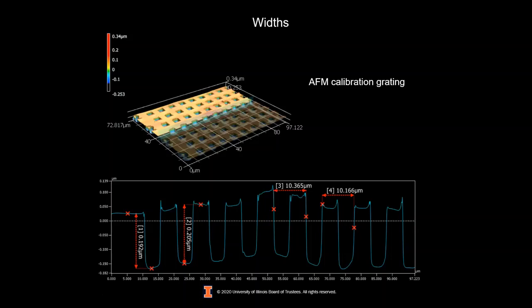but it's not always incredibly easy. So we took this image, and when it was recorded, it was actually tilted because everything is tilted on the nanoscale. So we subtracted a plane from everything. And that's why this part and this part are all the same height in the color. And there's a little bit of deviation here in the middle, probably due to not having done the flat field calibration right before having done this.